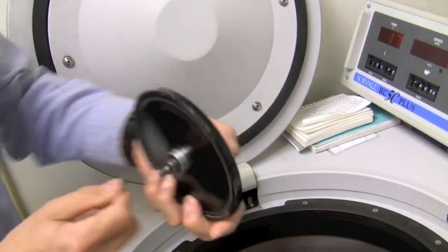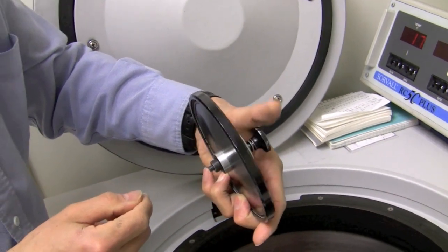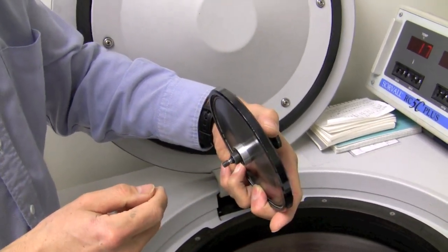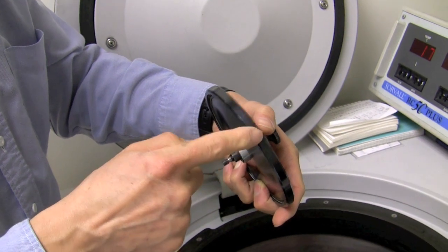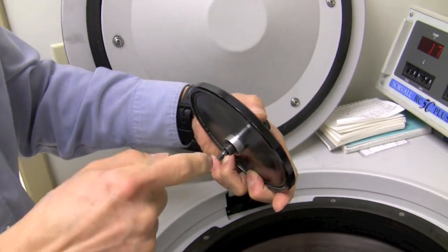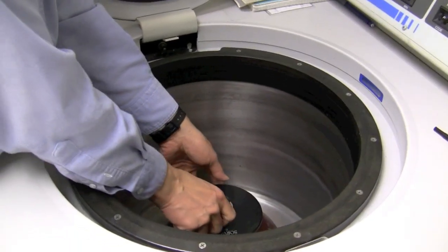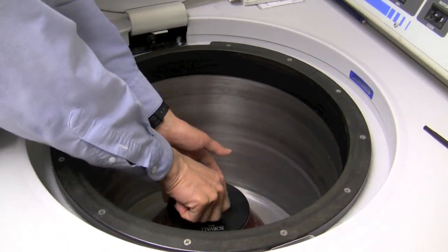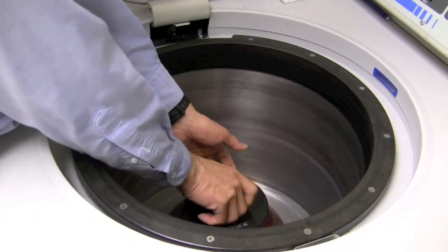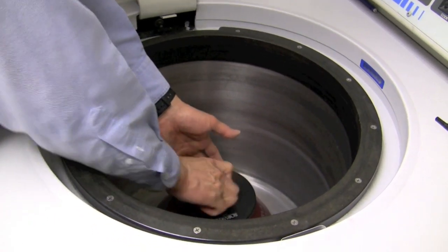There are two sets of knobs that I have to attach the lid to the rotor, as well as the rotor to the centrifuge. So first this is the silver outer ring, and I turn it counterclockwise until it's finger-tight.